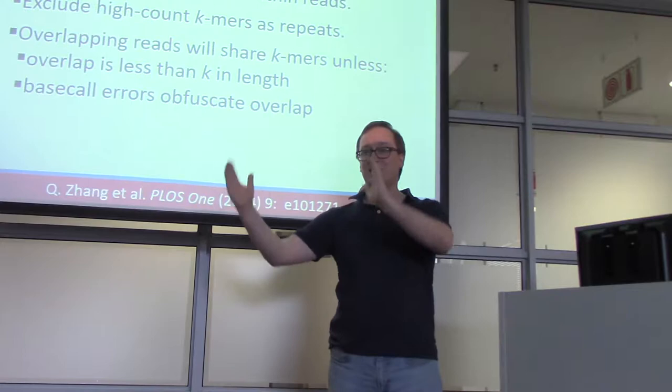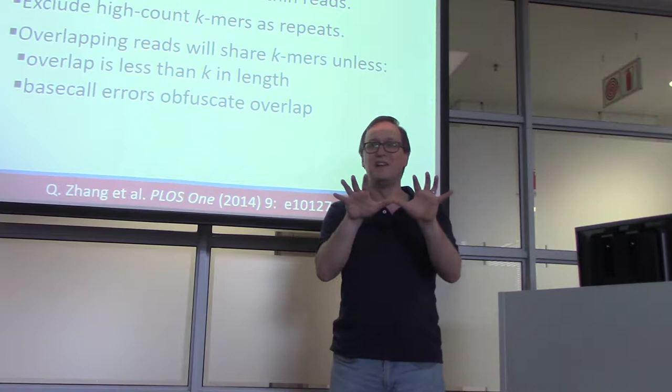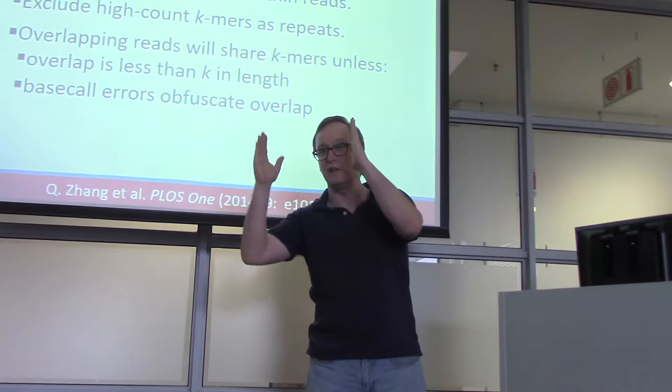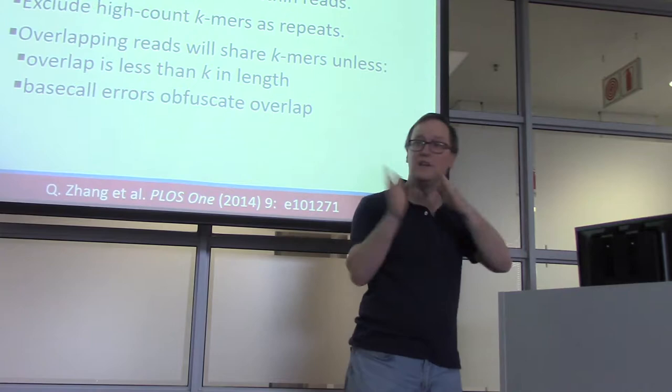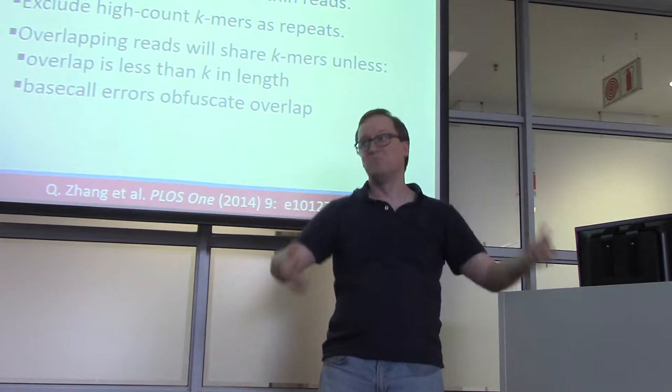The common answer I get from that is actually 2. People think, well, you've got the 25-mer starting at the left end, and you've got the 25-mer ending at the right end. But in fact, there are all those other positions in between. So you can think of this 50-letter sequence as being a whole bunch of 25-letter sequences, one starting at the first letter, a different one starting at the second letter, a different one starting at the third letter, the fourth, the fifth, and so on until you get to the 26th position.